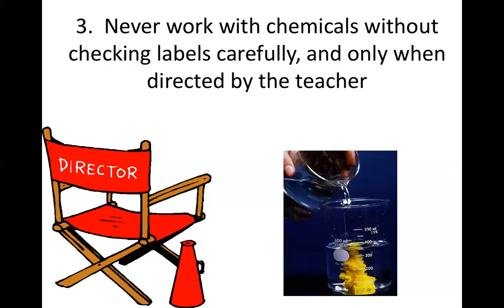Now, even if they are regular chemicals that you can find in the kitchen, you still have to be careful when it comes to handling them. And you only use them because it is directed by the teacher or is necessary for the laboratory experiment.